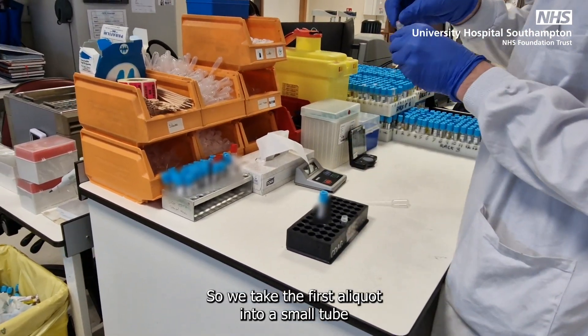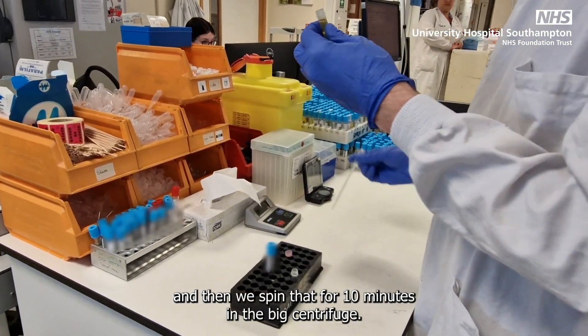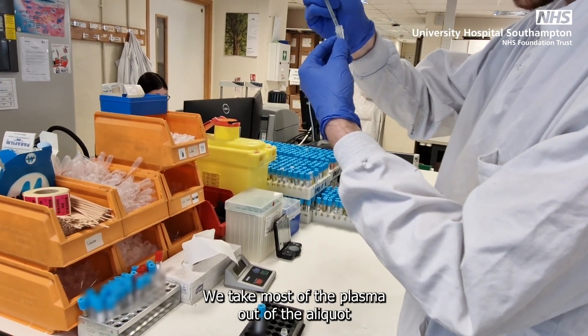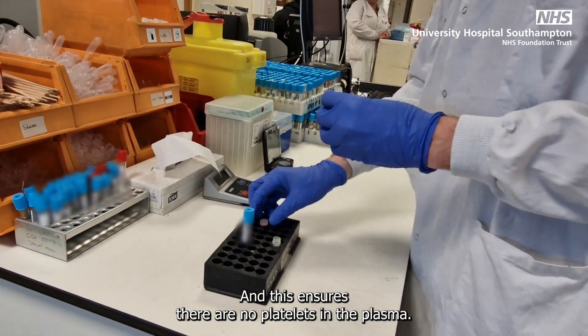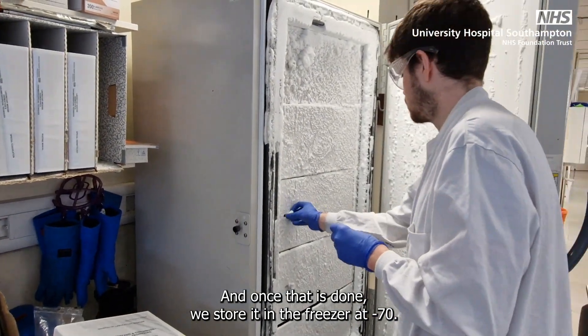We take the first aliquot into a small tube, and then spin that for 10 minutes in the big centrifuge. Once that's spun, we do the same thing again — we take most of the plasma out of the aliquot that's just spun and put it into a new small tube. This ensures there are no platelets in the plasma, and once that's done, we store it in the freezer at minus 70.